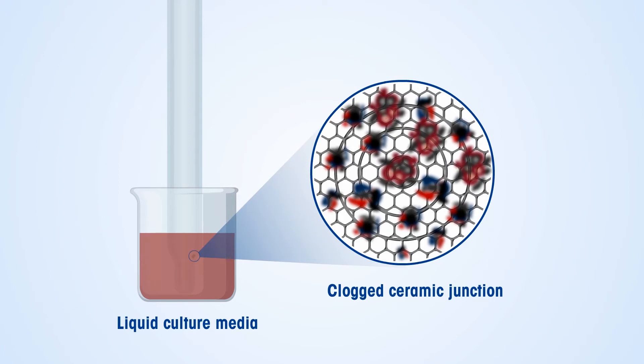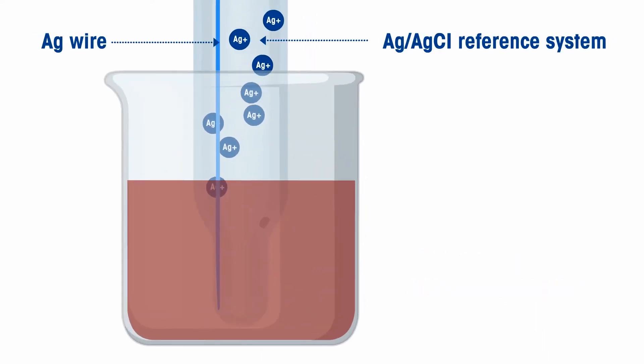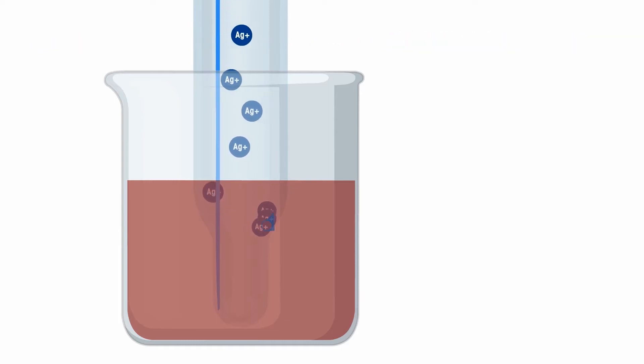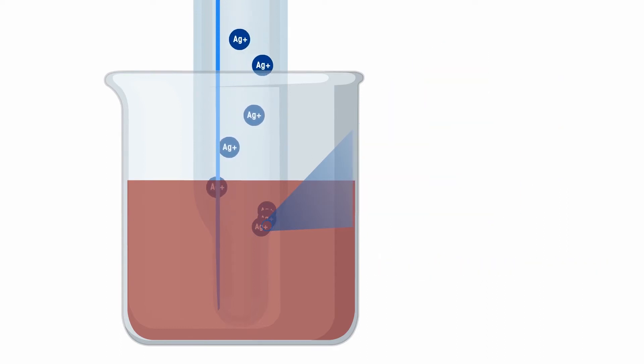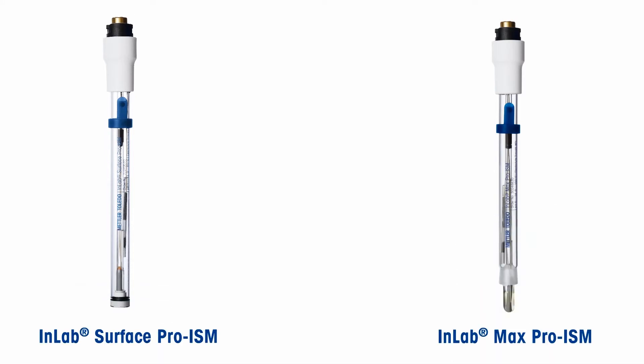The ceramic junction of a pH electrode can be clogged due to the complex sample matrix of liquid media. In conventional pH electrodes, there are free silver ions in the reference system that can leach into the sample and give unstable readings. They could also react with proteins from the sample and precipitate, resulting in clogging of the reference junction.